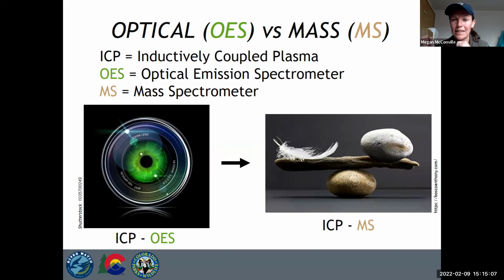mass spectrometer has this ability to very accurately measure minute differences in masses, like isotope differences, or in this picture, a slightly different feather, where we cut a few of those particular feathers off of that feather.